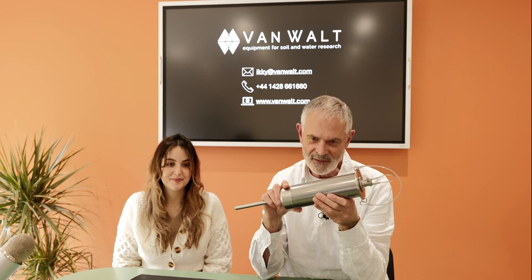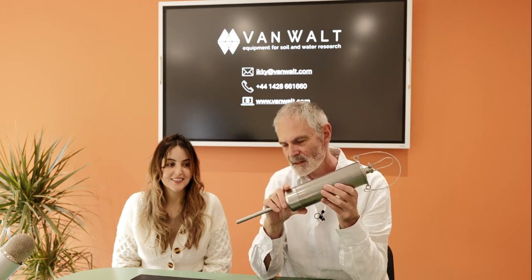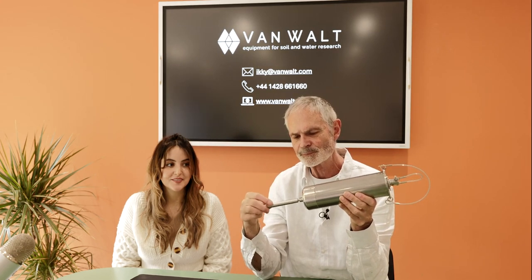Next on the line is a device which is called a bomb sampler. Now, I know we're talking about sediments, but actually this is both a sediment sampler and a water sampler. And what is it? I'm just going to disconnect this bottom rod. It's a stainless steel tube. It's more or less empty inside, but I'll show you what it looks like inside in a moment.